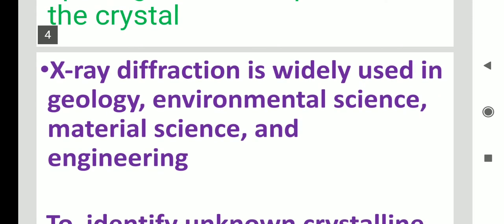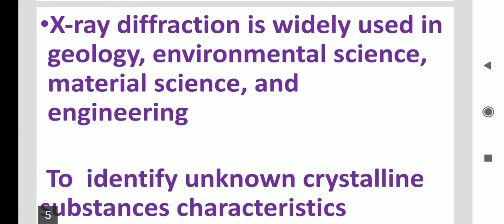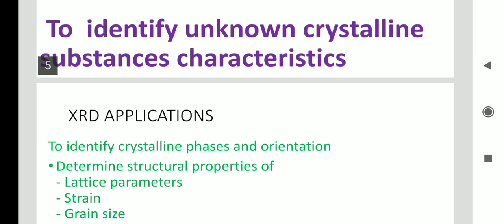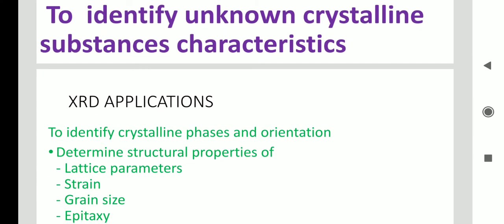X-ray diffraction is widely used in geology, environmental science, material science, and engineering, apart from physics and chemistry, for the purpose of identification of unknown crystalline substances and their characteristics. What are the applications of XRD?